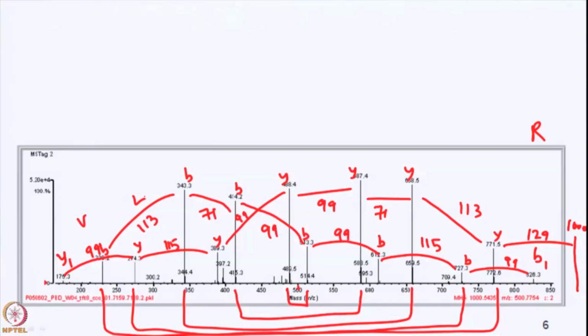When you do de novo sequencing, usually if we can't tell, we just choose leucine. I think the simplest reason is that there are 6 codons for leucine and 3 codons for isoleucine, so if you can't tell, might as well go with the one with more codons. At the end of the day, I can't tell that it's leucine rather than isoleucine.